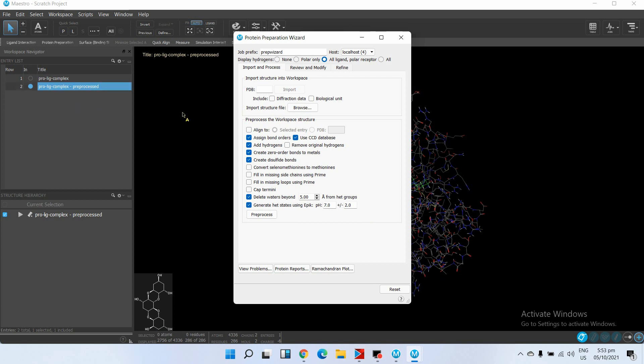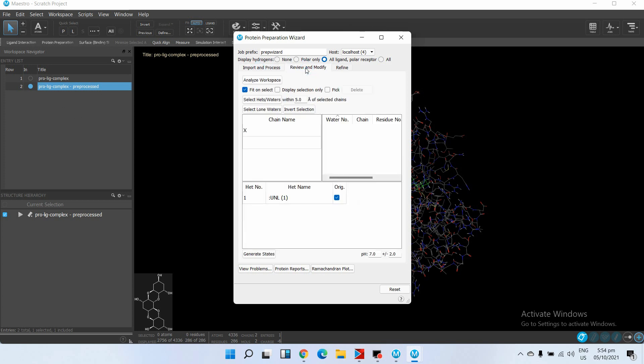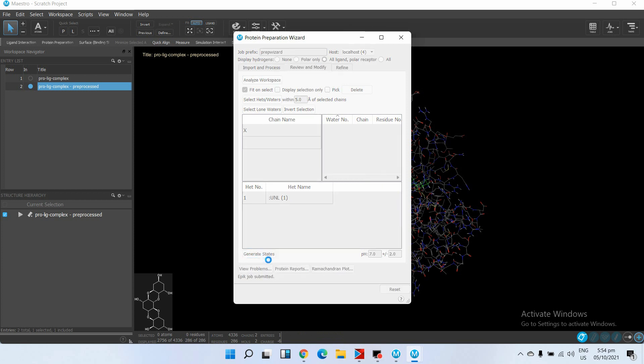At the end of the pre-processing, another pre-processed structure is added to your project list. Then go to Review and Modify, click on Analyze Workspace, and then click on Generate States.